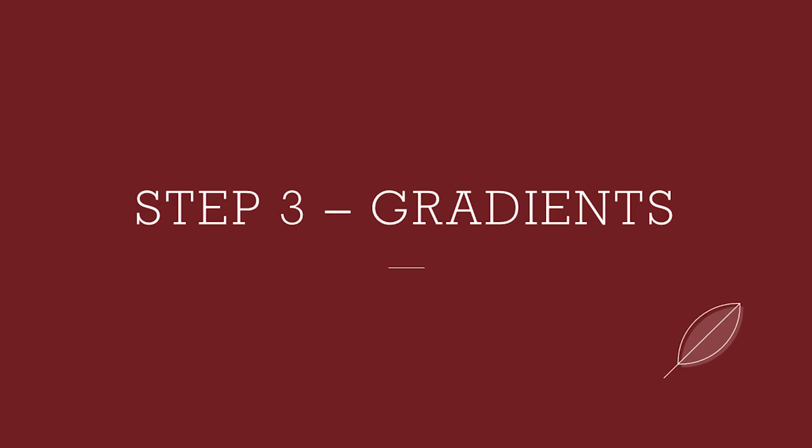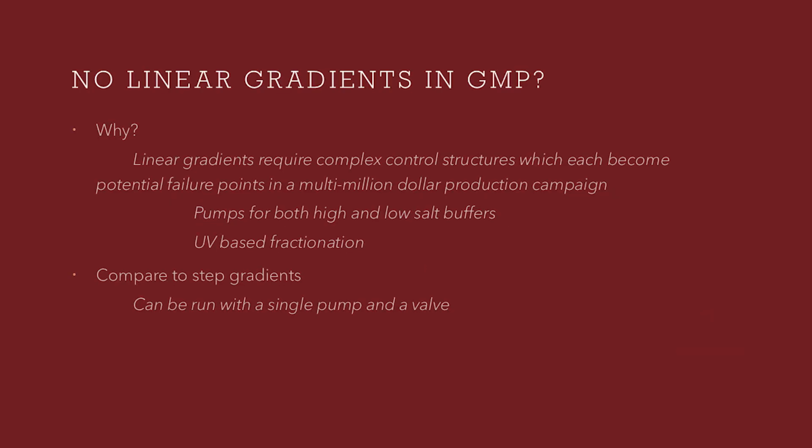Step 3. The linear gradients. Now the hero experiment, the broad linear gradient. Yes, someone in the back is already whispering, "We don't use gradients in GMP." Relax, Kevin. This is development. We're just mapping the terrain.